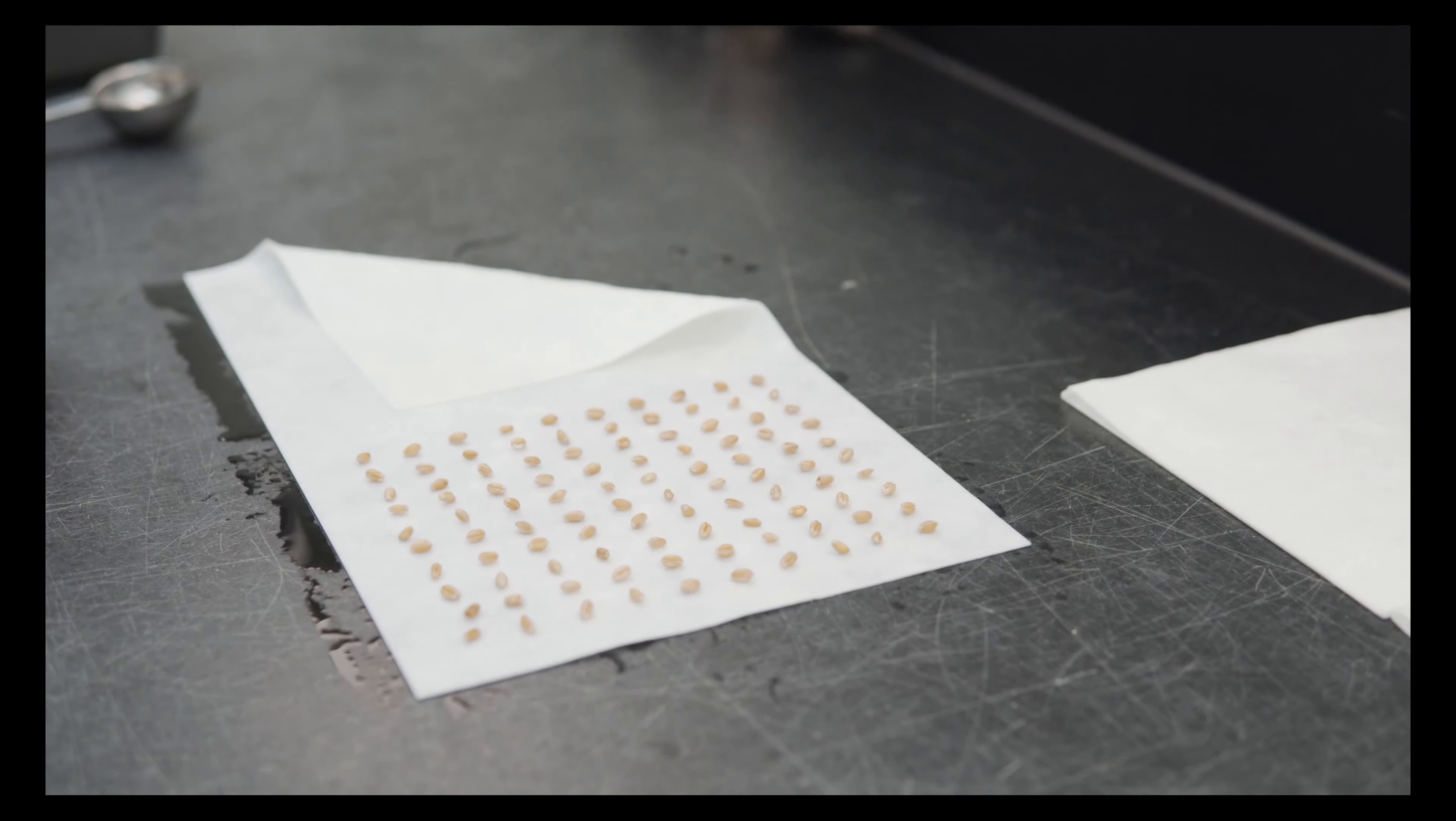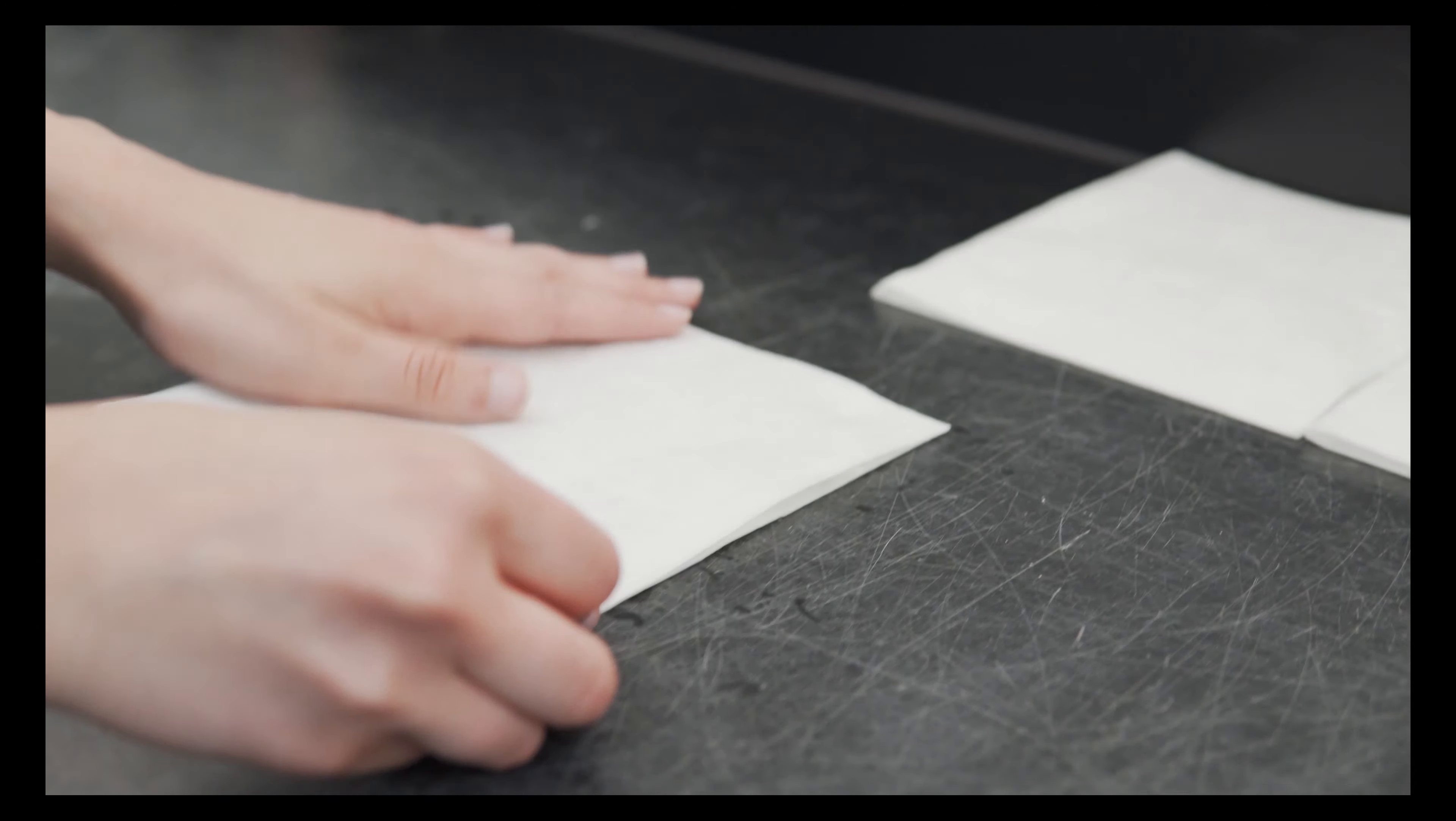The sample is barcoded with the sample and test information to be tracked by the lab and data collection.